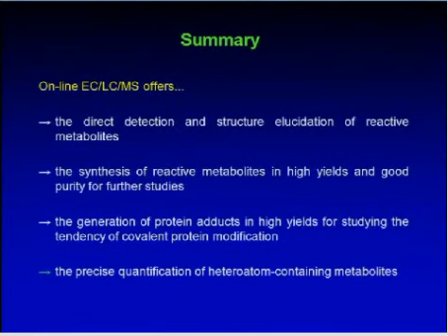Another question? There are very few pharmaceuticals that contain iodine or arsine. However, there are now more and more compounds that contain fluorine. So my question, do you also have an example with fluorine where ICP-MS gives quantitative results?